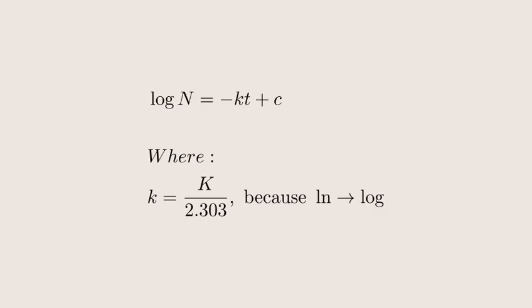used. Let's begin. We start off by establishing a relationship between the number of microorganisms and the time of sterilization, where n is the number of microorganisms and k is a constant dependent on the species of microorganisms and determines the rate of death. This equation shows that as time progresses, n changes by a factor of negative k. By rearranging the equation and taking the integral of both sides, it results in a logarithmic relation between n and time, where the previous capital K changes to small k because of changing the base of the logarithm from base e to base 10. We do this for the sake of practicality.